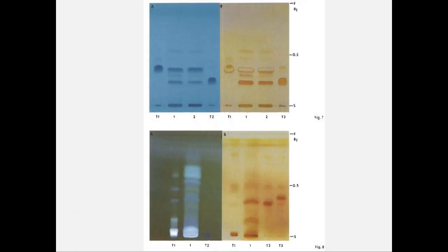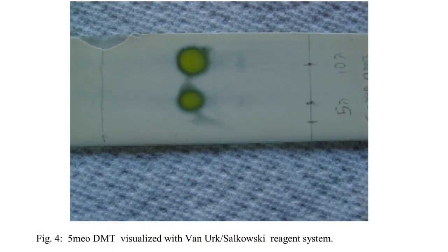I will close this by saying that these reagent tests have a better, more advanced use than what this video has described thus far. If you really want to be sure that some sample was a pure substance, you could always do thin layer chromatography on it. Once the plate is dry, examine it under UV to identify all the spots on the plate. Then spray it with the reagent in order to visualize the spot corresponding to the compound of interest. This will cause the spot to become colored and easily visible.